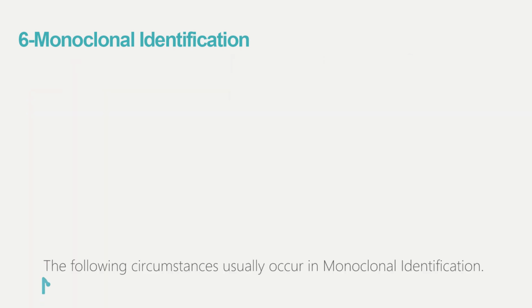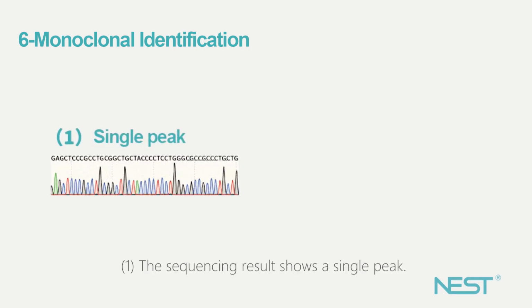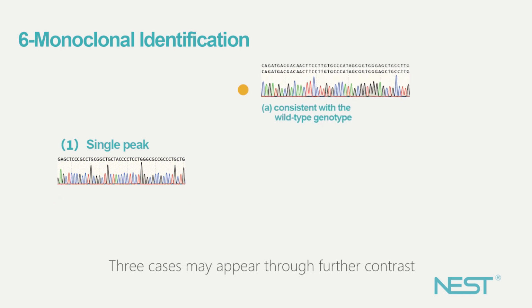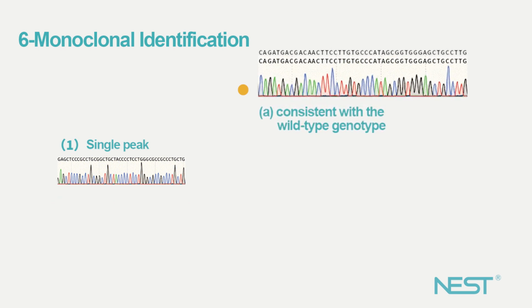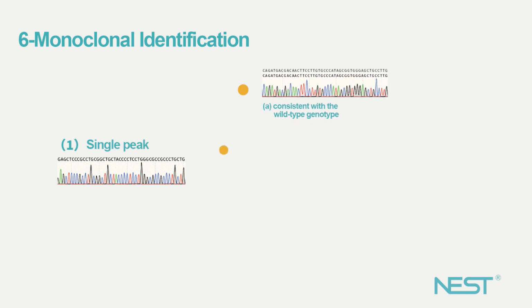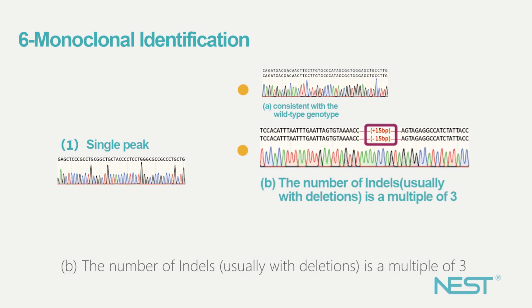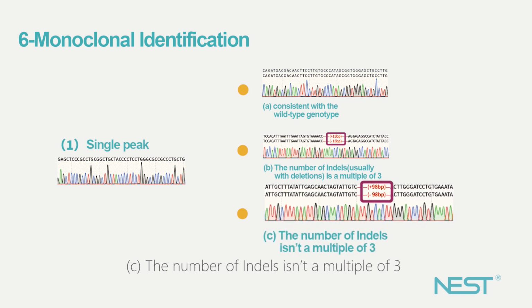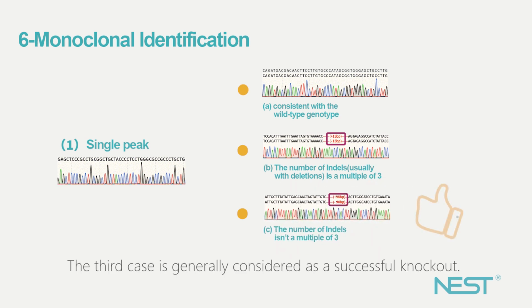The following circumstances usually occur in monoclonal identification. 1. The sequencing result shows a single peak. 3 cases may appear through further contrast with the wild-type gene sequence. A. Result is completely consistent with the wild-type genotype. B. The number of indels is a multiple of 3. C. The number of indels isn't a multiple of 3. The third case is generally considered as a successful knockout.